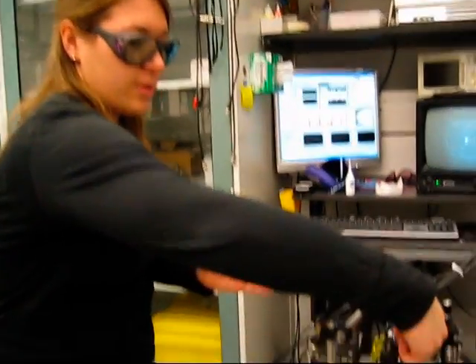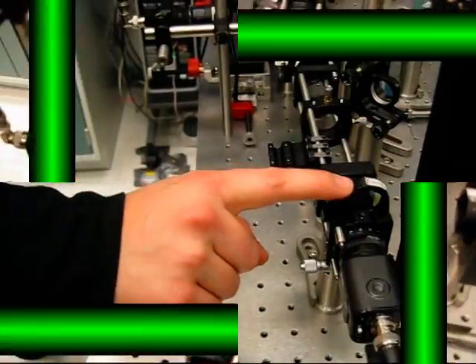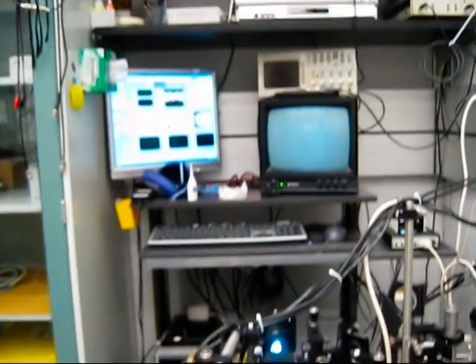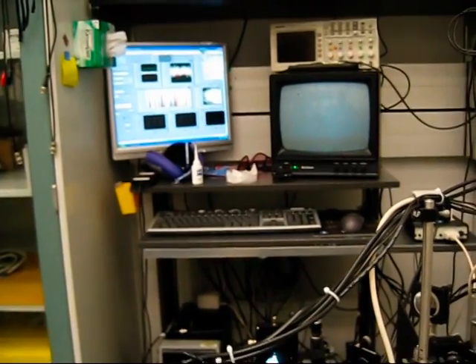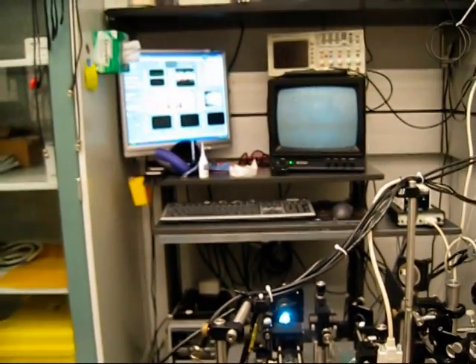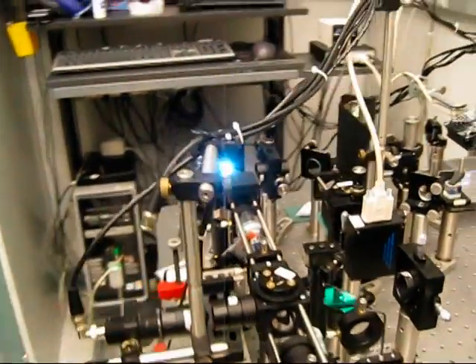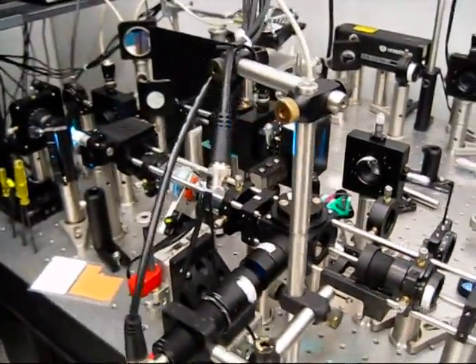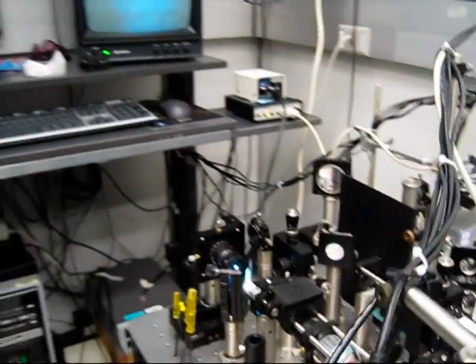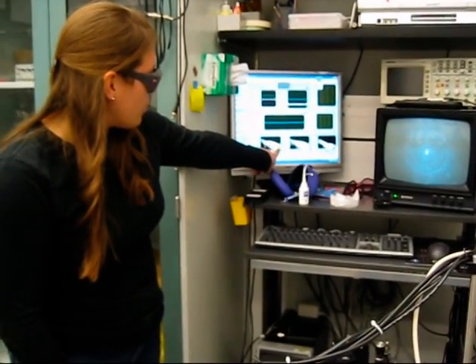The laser light is coming in this direction and coming back to the camera here. It's invisible to the normal light wavelengths, at least in the microscope, but it's still there — it's definitely trapped. If we look at the forward scattering, we can see that the signal is much lower, but there is still a corner frequency in the power spectrum. It's not quite aligned, but the effect is there.